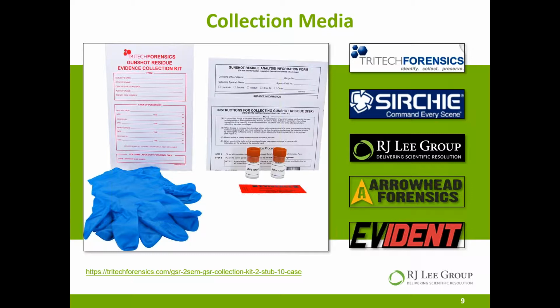These kits contain adhesive lifters. Those are these little cylinders that you see right here. I refer to them as stubs. Sometimes you hear them called dabs or dabbers or pin mounts even. But they're all the same thing. They're these little pieces of sampling media right there.